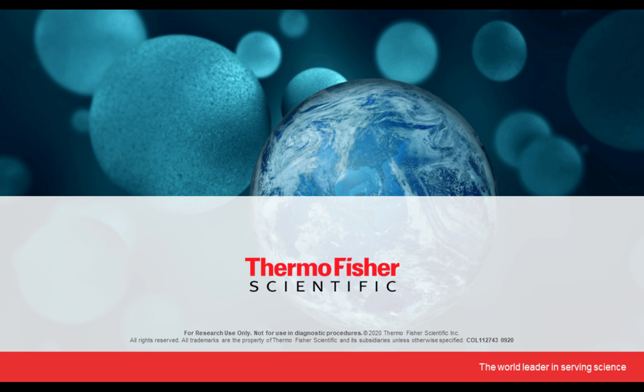Now, what if we do not have the iBright Imager? Are there any other methods we can use? The labeling can be excited and imaged using a wide range of imagers. If you have any other imagers that you are currently using, for example, for taking images of fluorescently probed labels or even your chemi blots, and they are able to excite within the UV range and then capture the images at 590, all of those would work.